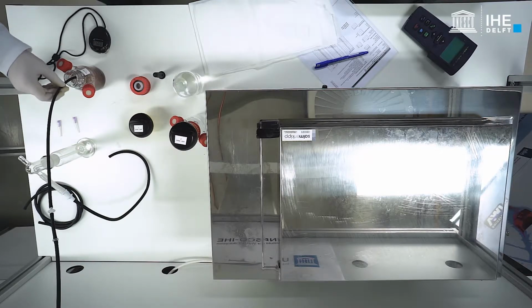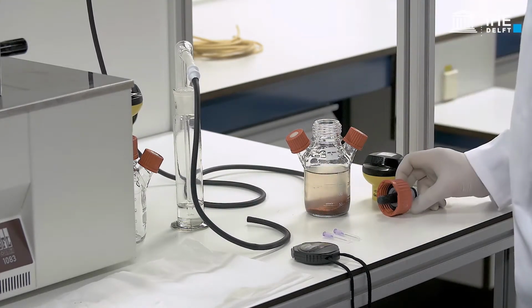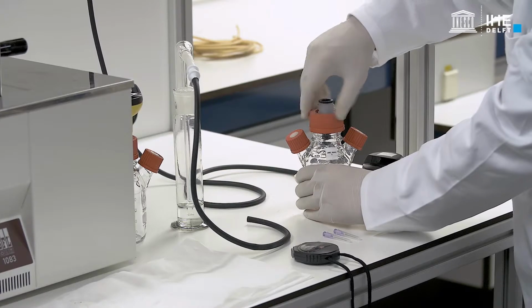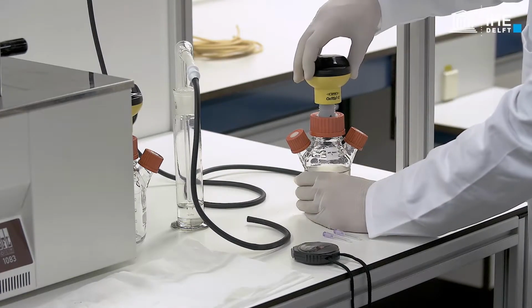In order to avoid excessive carbon dioxide stripping, a carbon dioxide containing gas mixture, for instance composed of 95% nitrogen gas and 5% carbon dioxide, can be used instead of nitrogen gas.